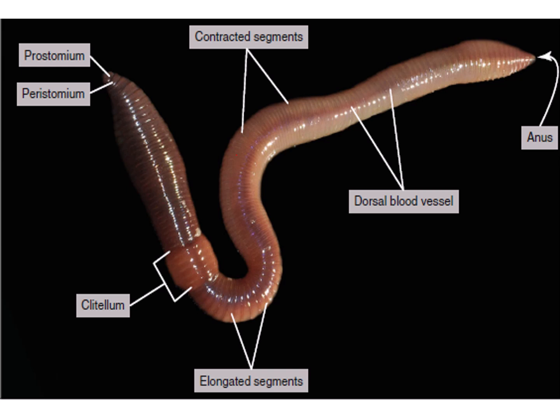The adult earthworms that are sexually mature have a distinct, very visible type of segment, a swelling-like region that is called the clitellum on the dorsal surface of the earthworm. The sexually immature or young earthworms would not have this region.